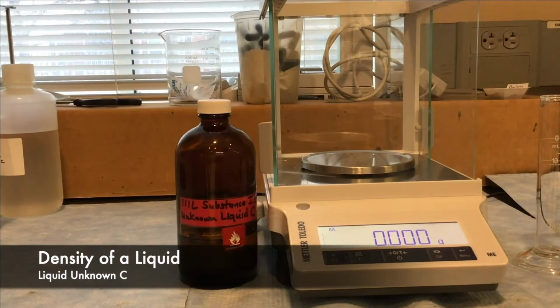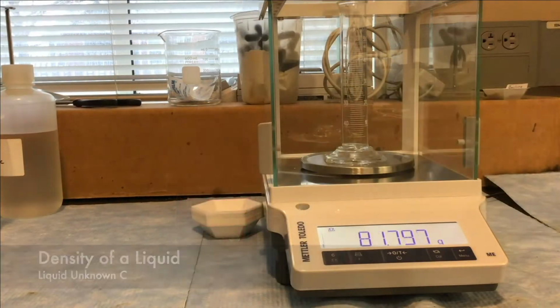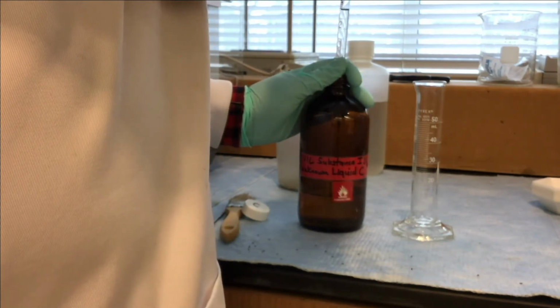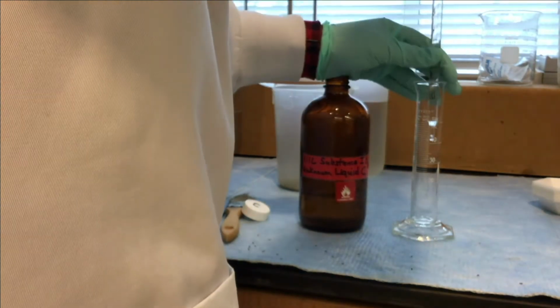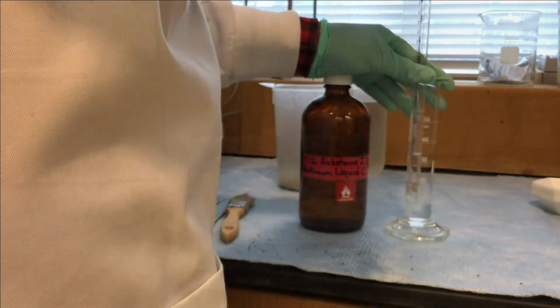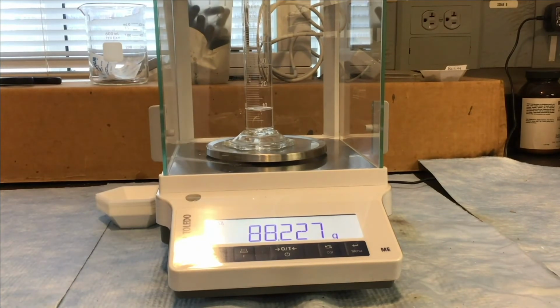Now we're going to find the density of our unknown liquid C. First, we're going to take a 50 milliliter graduated cylinder and find its mass. We're going to record the mass. Then we're going to measure 10 milliliters of our unknown liquid and add it into our graduated cylinder that we just weighed. After we add our liquid, we're going to again measure the mass and record the results.